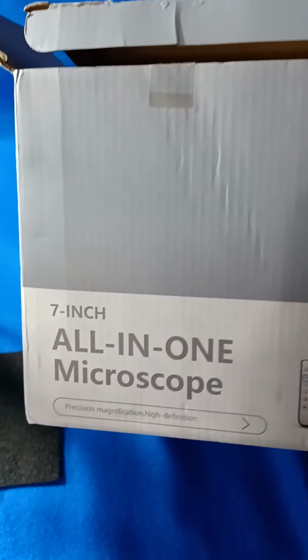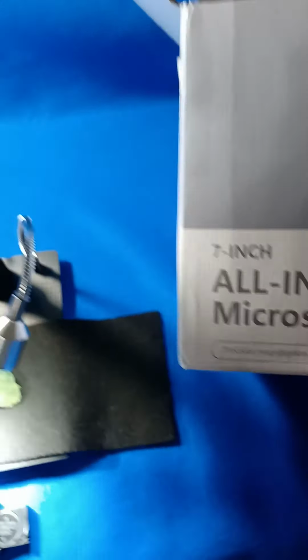This is the Hayear 7-inch 2070 microscope. First problem, there is the remote. You can see the battery is installed properly. Now let's bring up the menu.